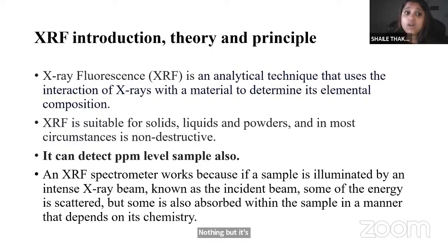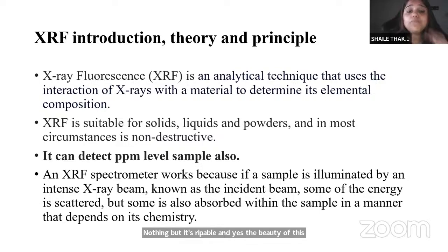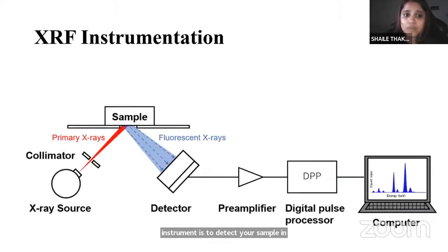And yes, the beauty of this instrument is to detect your sample at ppm level. Can you imagine, the ppm level is a very, very small parts per million level, right? That is a very, very low amount of the sample it can analyze. Then think how sensitive this instrument is, okay?